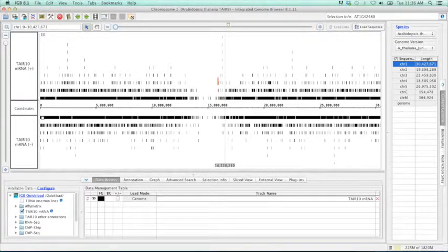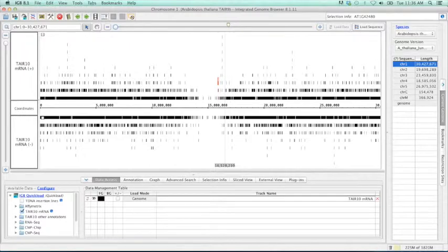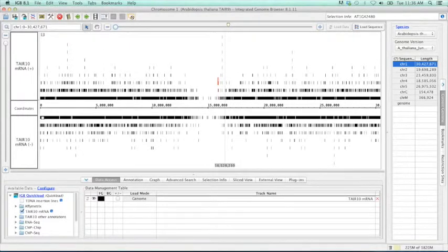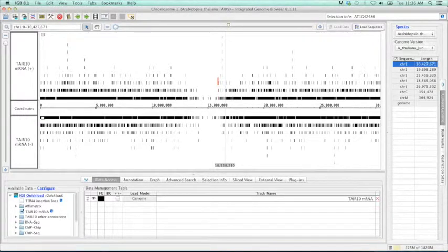Now that we've had a brief refresher on navigating through IGBI, I want to provide us with an example of alternative splicing, and then we will investigate it. In our example, let's pretend we just finished a large RNA-seq experiment where we were interested in the differences in alternative splicing between a control group and an experimental group that was cold treated. Let's load up this data and take a look.